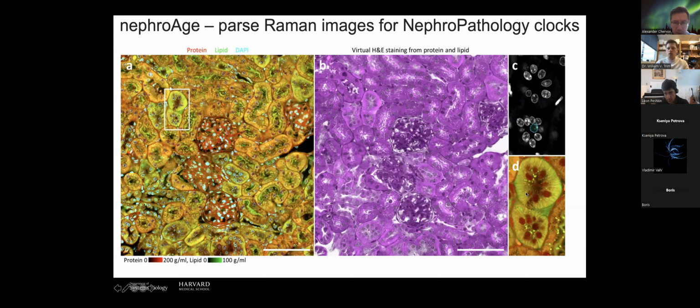Yes. Okay. So these are two tubules, or two cross sections of a tubule. Here's one, here's another, and let me show you an outline of one cell. It would be something like that. So this is a nucleus of this individual cell, and then there's another cell immediately adjacent to it. This is a nucleus. Here's another cell and the nucleus of that cell. Right, do you see? So there are 10 or so cells holding hands. Together they make a tubule. Is that clearer now?